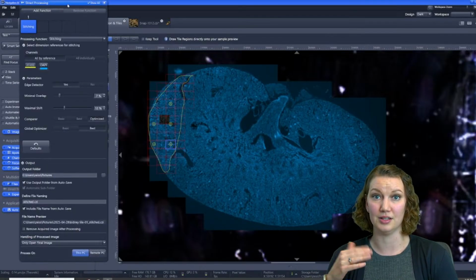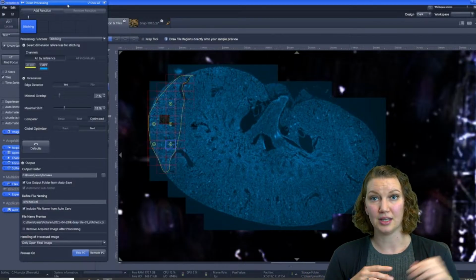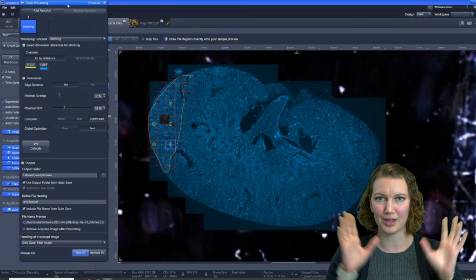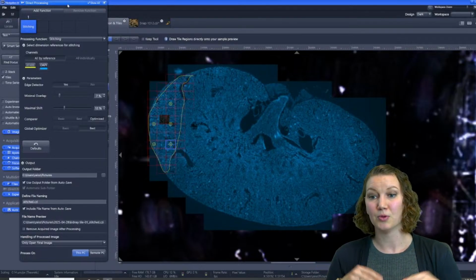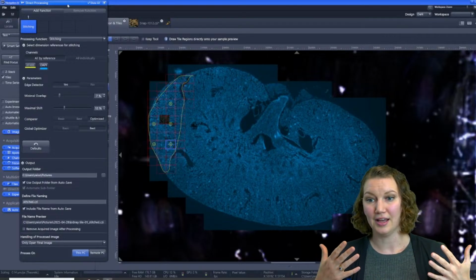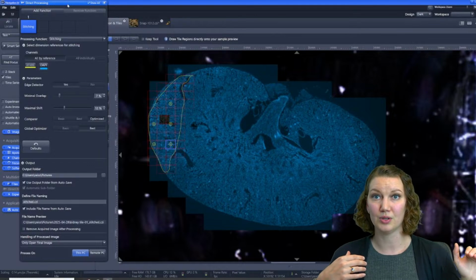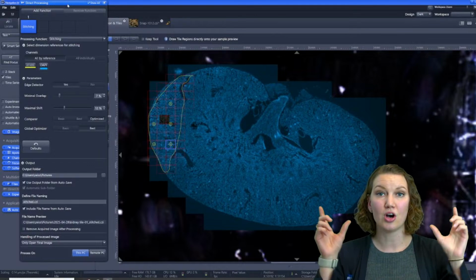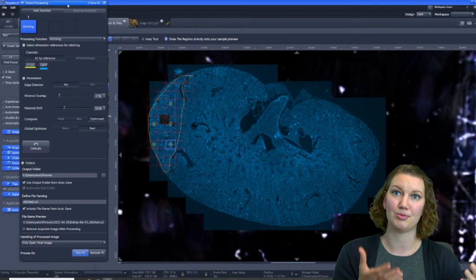So for example, here in this first example, we're on a Widefield microscope. I went in and selected direct processing in the software, which, don't worry, I will show a few times if you missed it this first round. What's really nice about this, we're just going to do some basic tiling here. And what you can see is when I selected direct processing in this drop-down window that's come down, we have all the same functionality that you would see if you were doing this after your experiment in the processing tab, right?